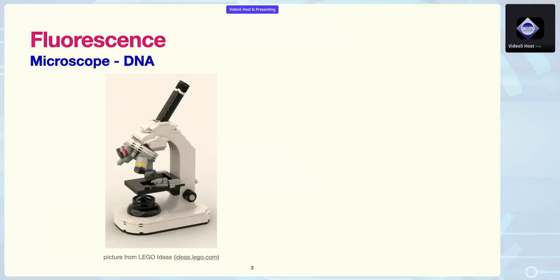So microscopy techniques can be used for different studies, usually to study interaction or the behavior of cells and tissue. And the type of microscopy that we use is dependent on what we want to see or monitor. But today is about fluorescence microscopy, which is mainly used to study DNA. And I think I have to give you a bit of biology here.